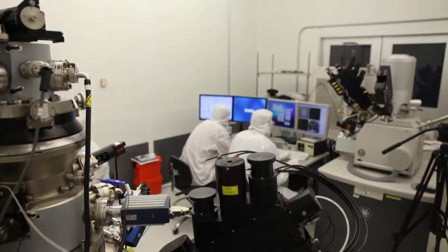The Nanofabrication Research Laboratory is a 10,000 square foot clean room with conventional nanofabrication equipment. This includes lithography methods, such as photo and electron lithography. We have deposition methods, including physical vapor deposition and chemical vapor deposition. Material can also be removed.